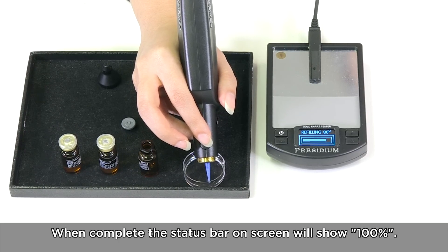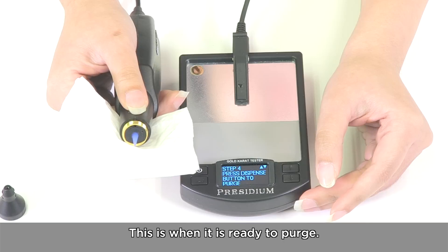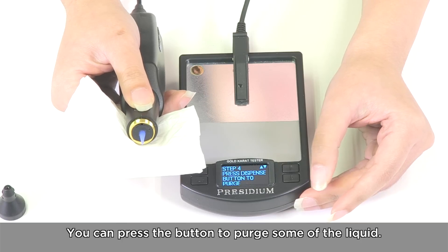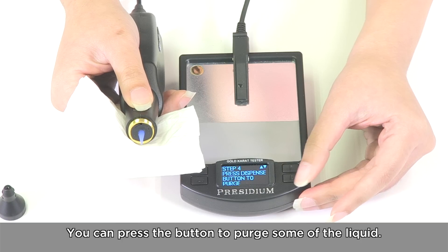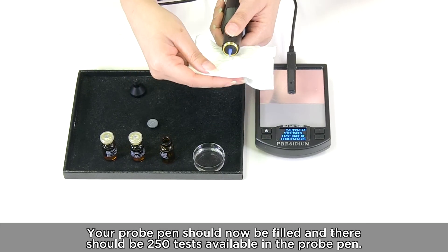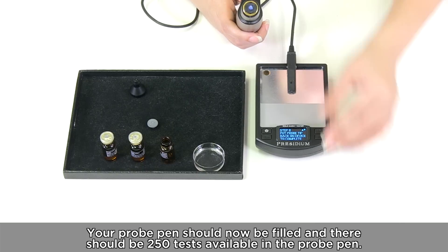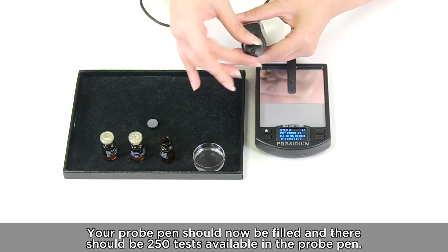When complete, the status bar on screen will show 100%. This is when it is ready to purge. You can press the button to purge some of the liquid. Replace the probe tip over the nozzle carefully. Your probe pen should now be filled and there should be about 250 tests available.